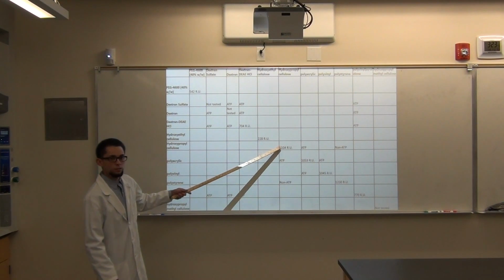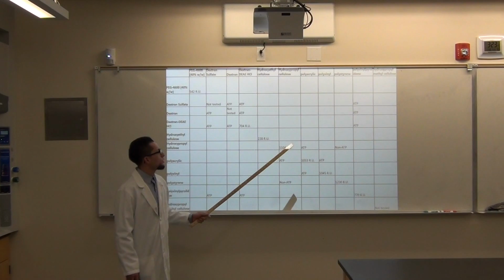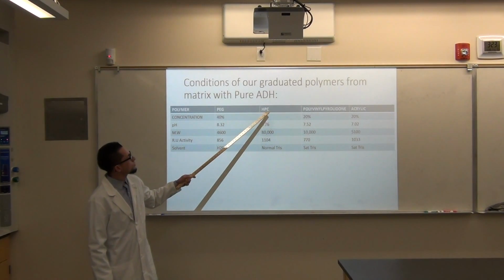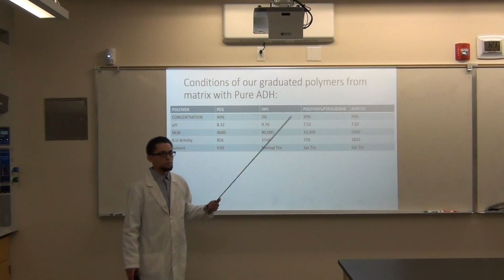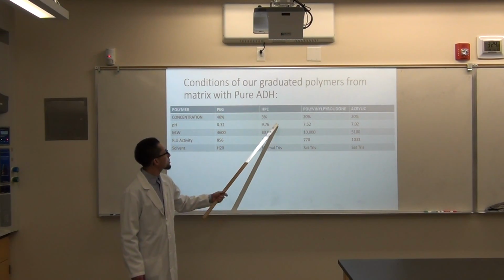Great increase. Is tris a polar solution? Tris is a buffer. Oh, okay. Yeah, that's right. And it's obviously stabilizing, maintaining the ADH structural features that are keeping it active. But you measured the pH of your water too. It was at the right pH. Yes, these are actually the pHs right here.